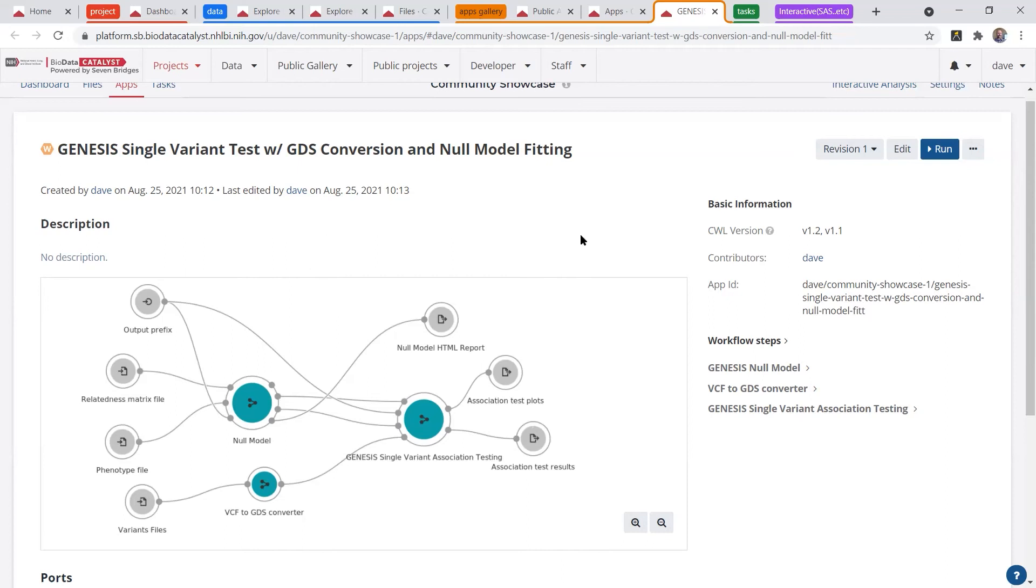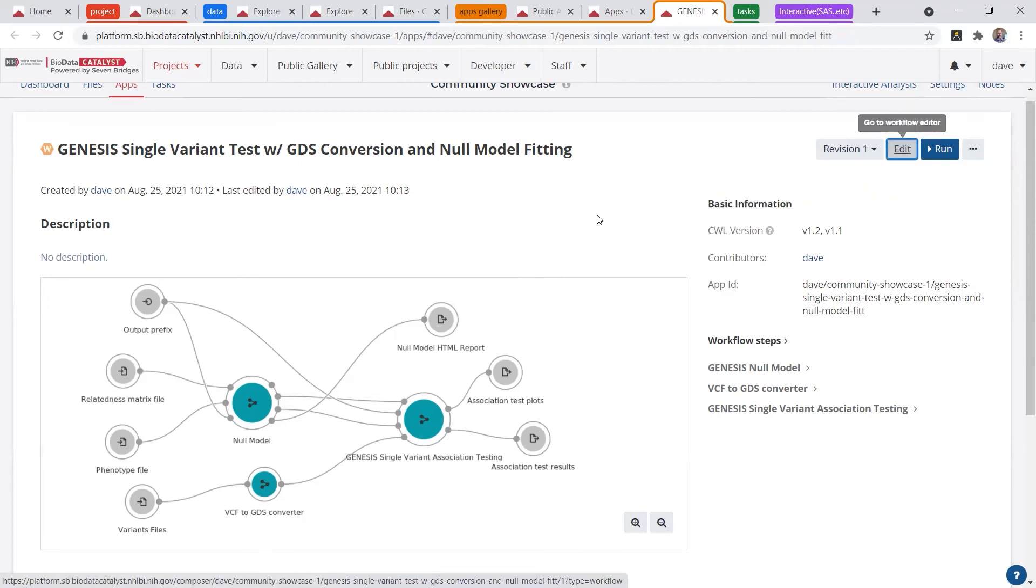So to get to the editor from an app, you would just click edit, and that would open up the workflow editor canvas.